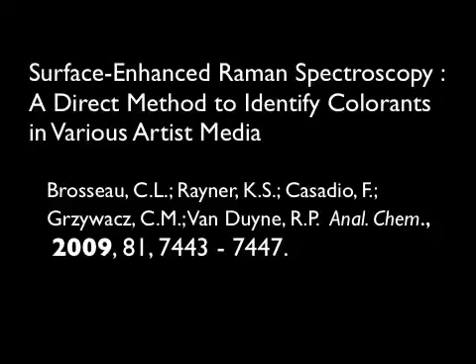So recently, I came across this really neat chemistry article, and I thought the chemistry was so cool that I wanted to share it with you. The title of the article is Surface-Enhanced Raman Spectroscopy, a direct method to identify colorants in various artist media. If you want to read the article, just pause this video and copy down the reference.